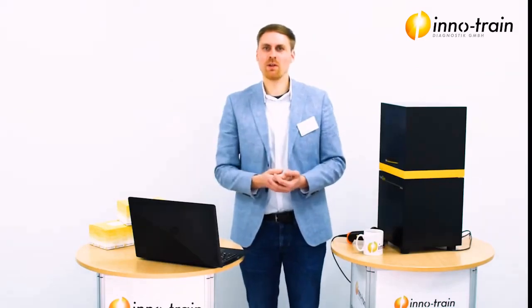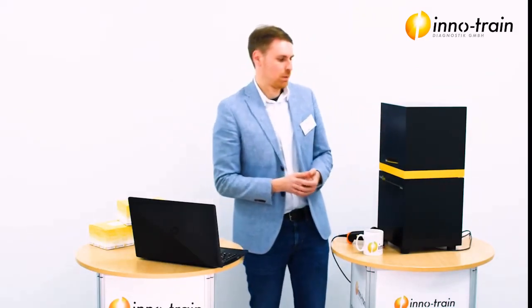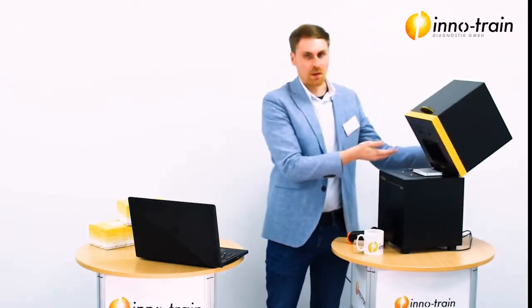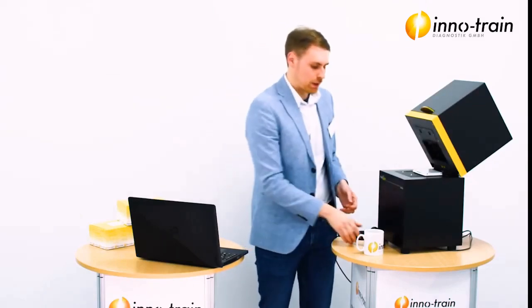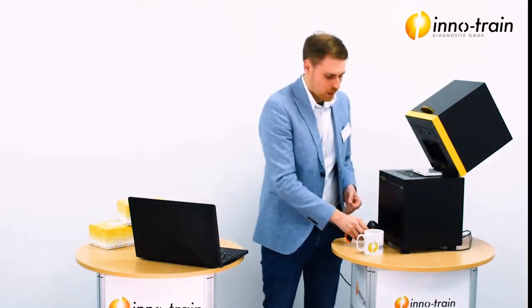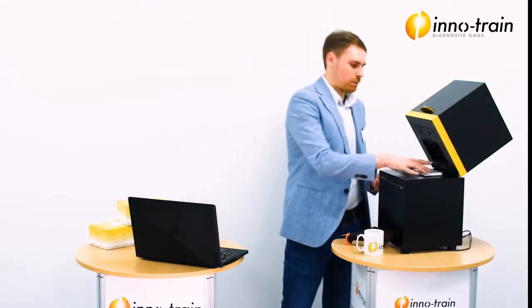And now we can continue, and I show you how to get the data from the cube into the laptop. Just have to open it. Each of our plates is barcode labeled, and with a scanner you can scan this barcode, and so the data will be transferred to your FluoGene software.